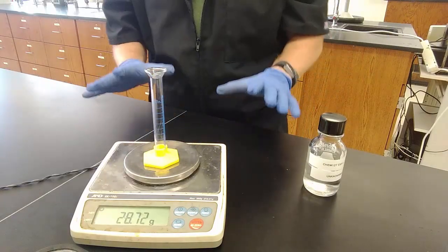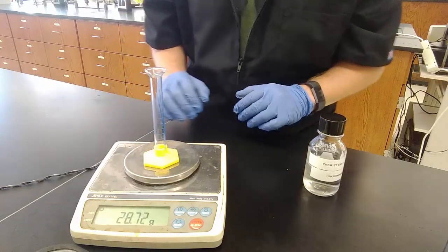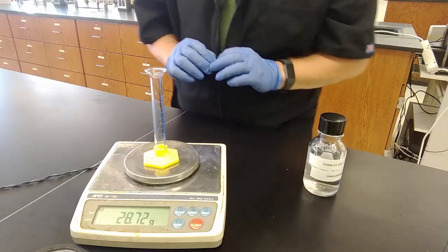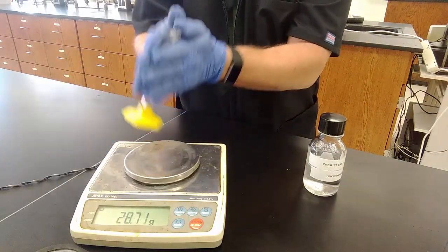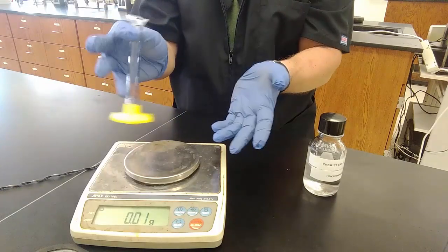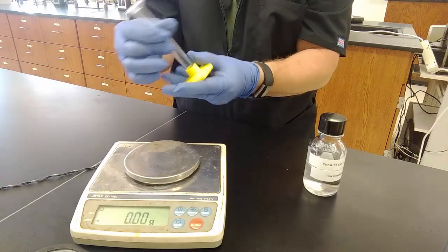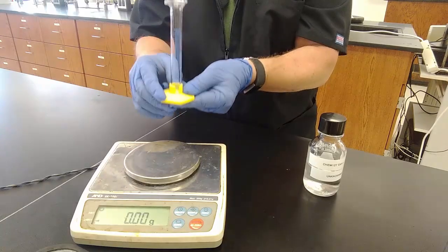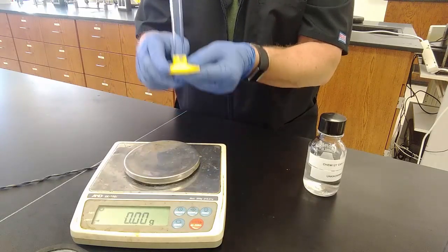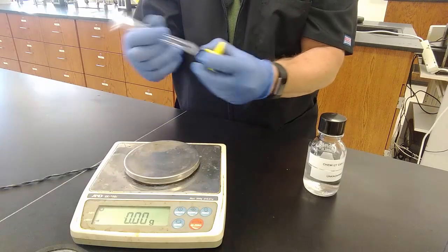All right, you don't want to touch the table when you're weighing things. It's a bad idea. So 28.72 is the mass of our graduated cylinder empty. Now notice I'm not rubbing my fingers all over this. I have gloves on, so I'm not getting fingerprints and greasy fingers and whatever fried chicken you had for lunch all over the graduated cylinder. It's staying nice and clean, and there's nothing in it.